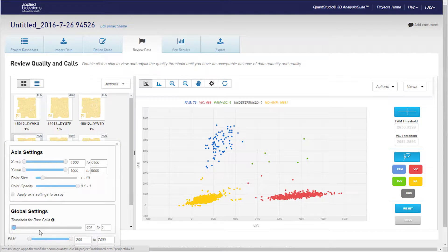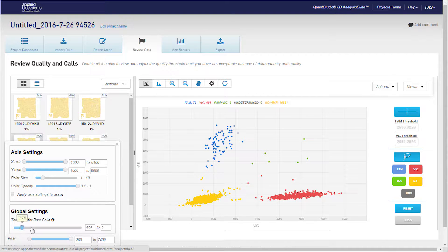The values on the threshold are logarithmic values due to the fact that the density of the non-amplification and wild type clusters are much greater than the density of the clusters associated with the rare target.